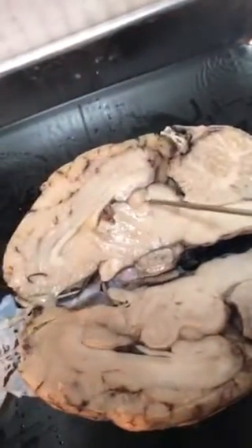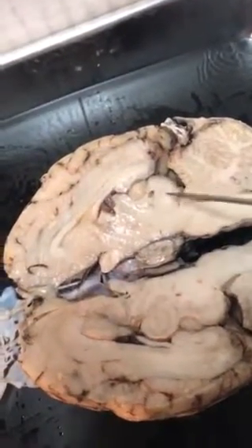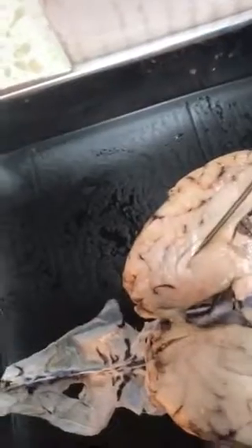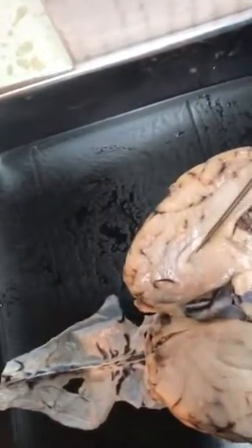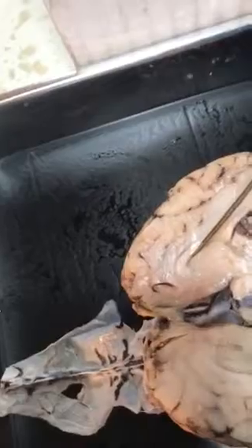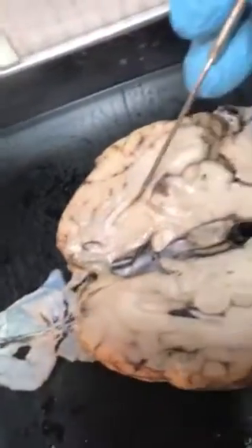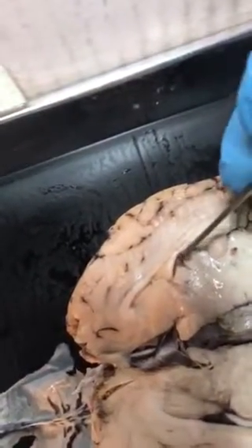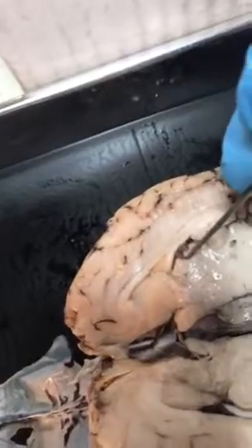You have the thalamus right here, and then the hypothalamus right here. The lateral ventricle is this right here. Underneath the corpus callosum is the lateral ventricle. Your third ventricle is this space right here. Third ventricle. And then underneath that, right here, you have your fourth ventricle.